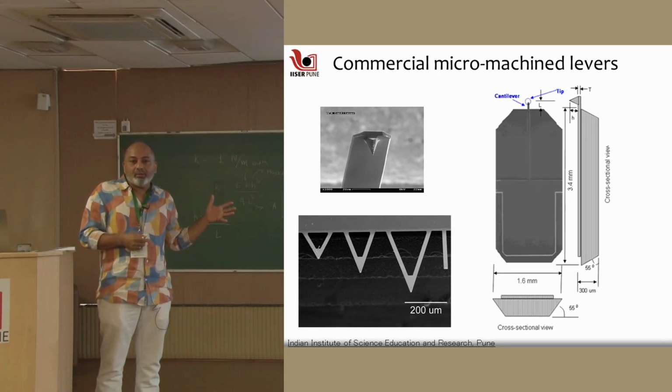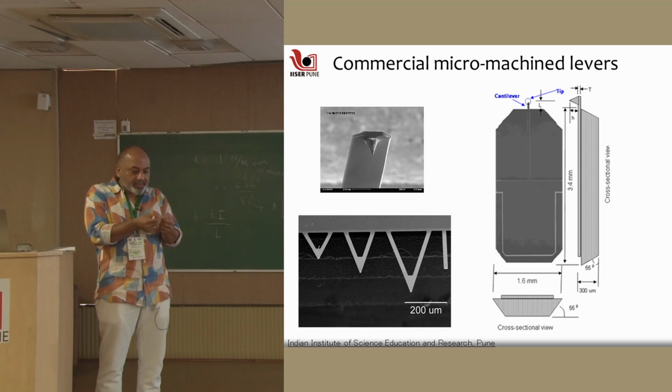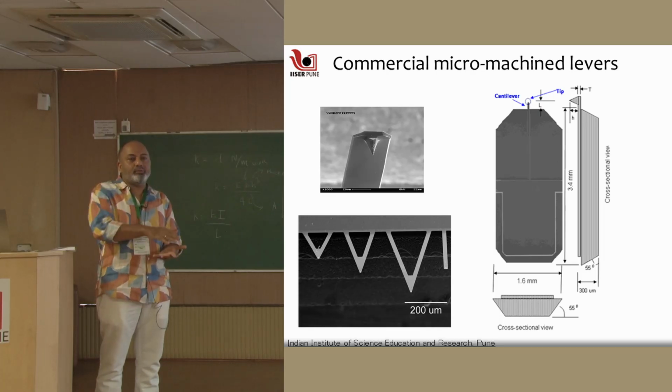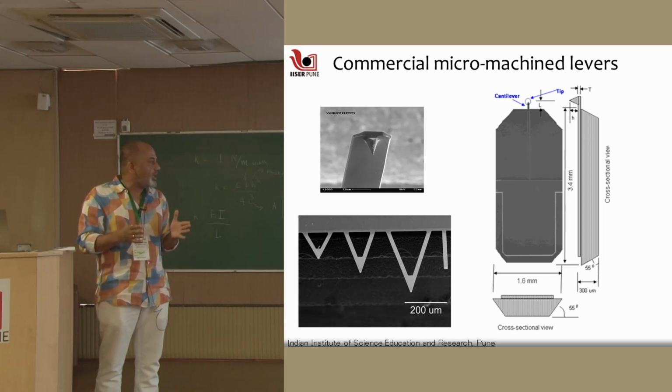They then said, look at the IC industry, integrated chips. Integrated chips at that time were making designs and small objects using focused ion beam and whatever the chip microfabrication technology, layers of different kinds of materials, etching them out so that you can make features of the order of 10 microns, 5 microns.